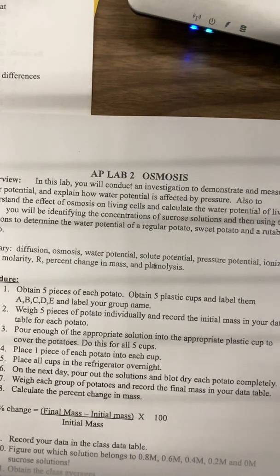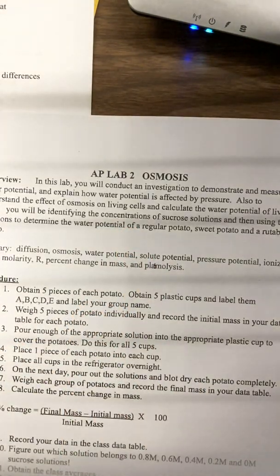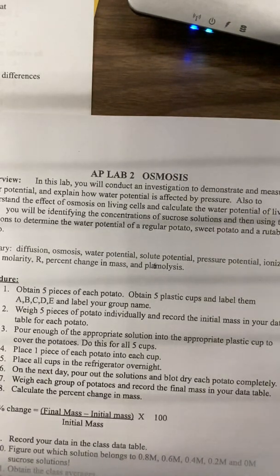After that, you're going to do the purpose. There's only one part for this, so the purpose of this lab, I already told you, is to identify the concentration of the sucrose solutions, because you will not know which solution is 0, which solution is 0.2 molar, which solution is 0.4 or 0.6, etc. You will have no clue. They're going to be color-coded with letters. So that's our first goal, is to figure out the concentration of sucrose, and then our second goal is to figure out and determine the water potential of those 3 kinds of potatoes.